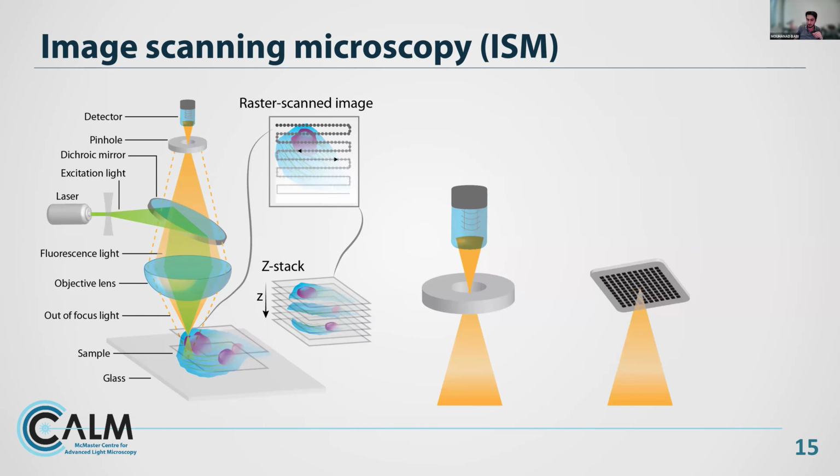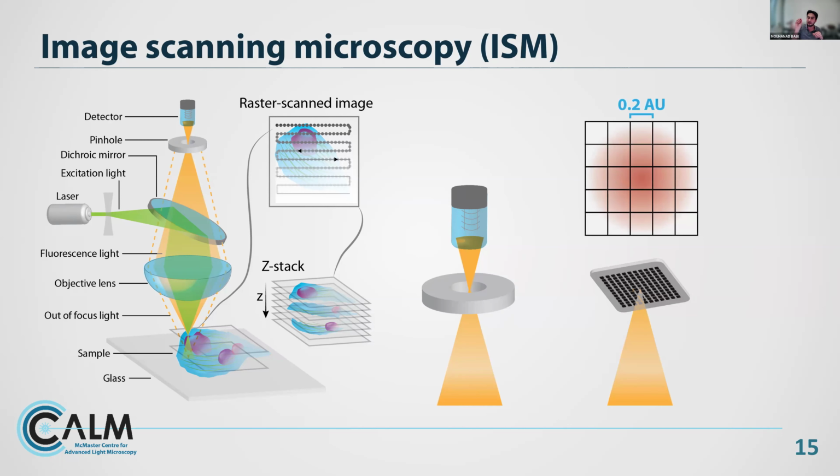You can think of a very small camera with tiny pixels that each represent a very small pinhole. If you go deep into confocal microscopy, you'll know that if the pinhole is shrunk beyond one Airy unit, the size of the point spread function, you get higher lateral resolution. And if you completely close it down, you can get a resolution of up to 140 nanometers.